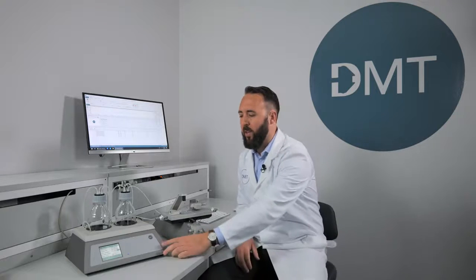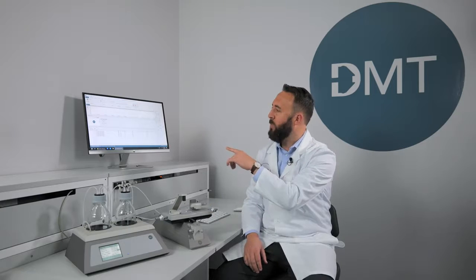We're going to look at the pressure interface, the 114 chamber, the MyoView software, and the accessories that come with your system.